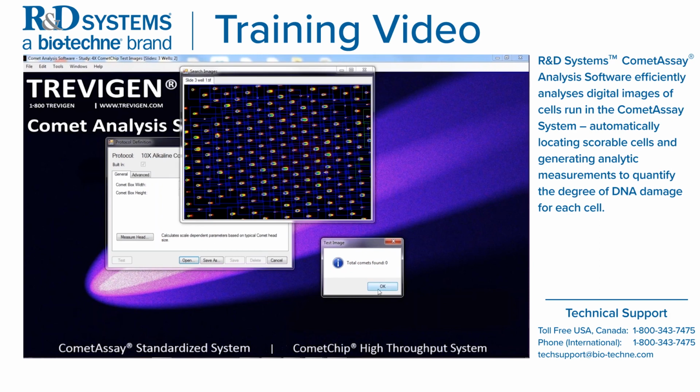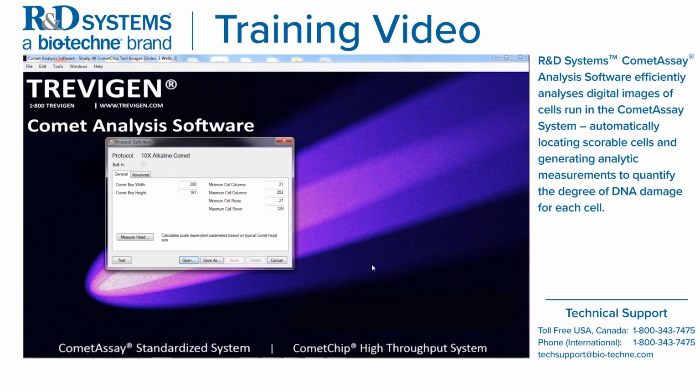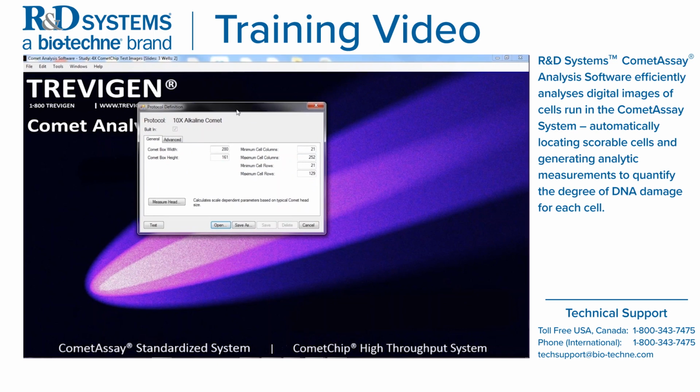All right, so to create a new protocol, what you're going to do is start from a default protocol, right? So the default protocol already has some parameters built in.